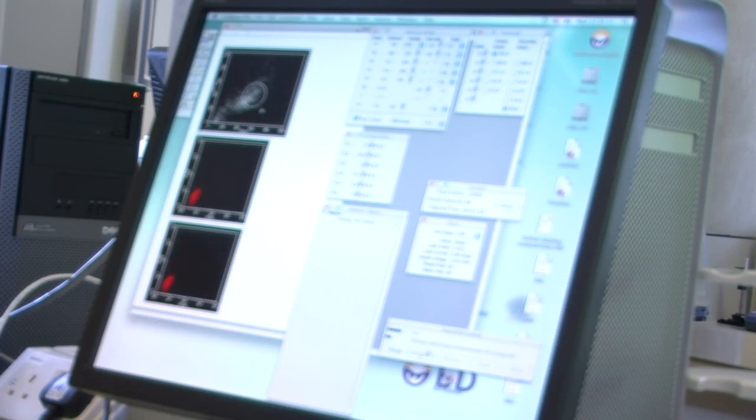It's 12 o'clock now. I don't know how long we have. We've got fluorescence. I'm happy to just keep running these anyway. I suppose it depends if you have other classes you have to get to. So if you have time to stay and everything is running, that's fine. If you have things that you need to attend after, you can leave now, and what we will do is we share the data. We will have time to have another discussion about this data collection. But you will have access to the data.